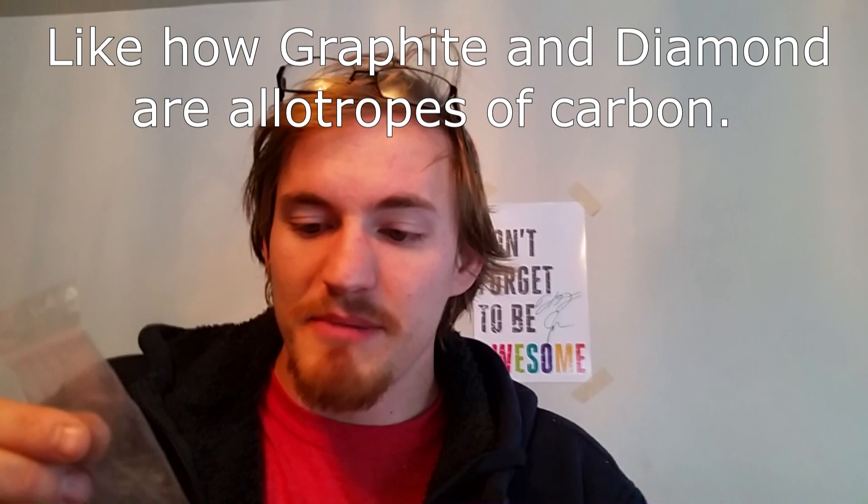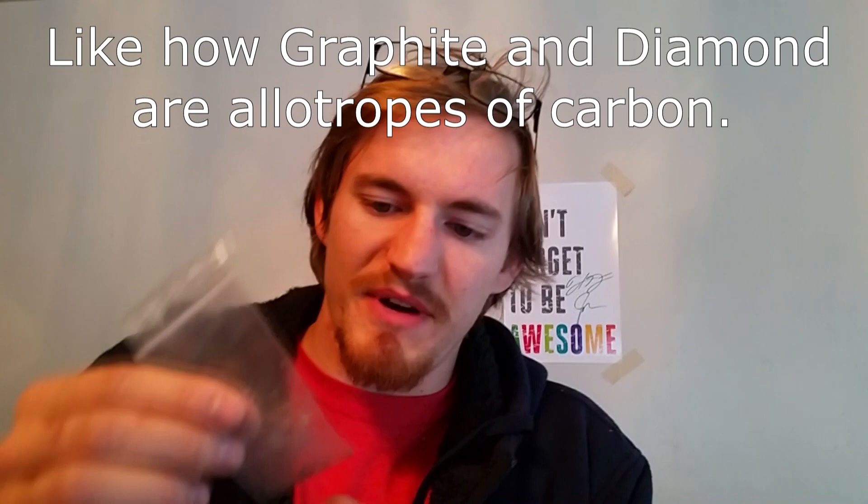Hi everyone, welcome back to Cody's Lab. I have here some gray tin, which is an allotrope of tin — a non-metallic form where it's elemental, but converted from white tin, the metallic form that's bendy, to this form which is very brittle and kind of acts like a ceramic. It has large crystals, is slightly more expanded, and is a dark gray color.